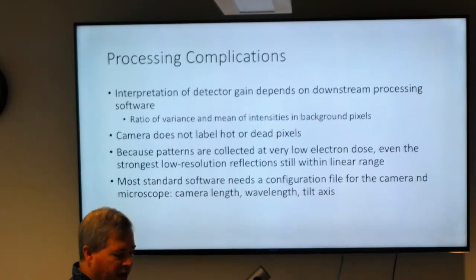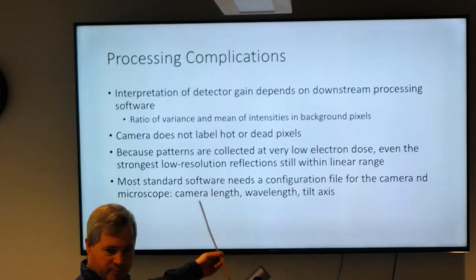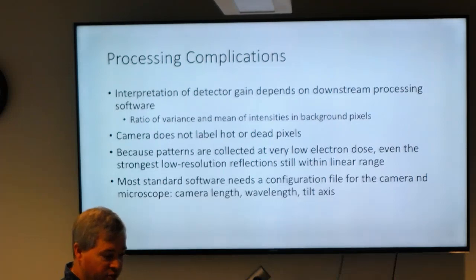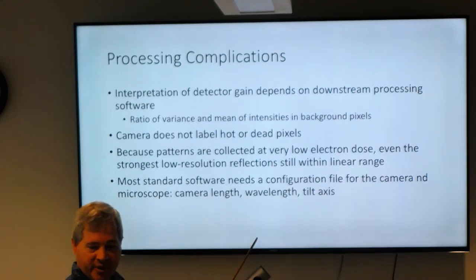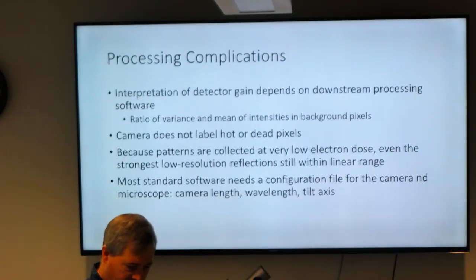So I think you do need someone who has some background in processing these. Ideally you would work with someone who has an X-ray crystallography background, who already knows the software well, and could then help configure it for your hardware and for your experiment.